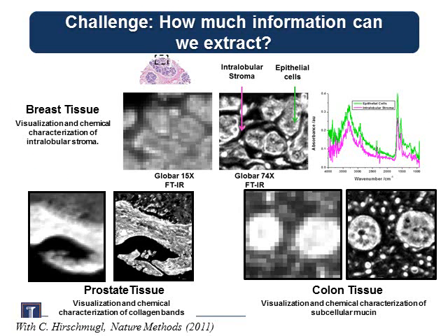So this is, again, slightly older data, and this is an old story now. On the left-hand side in all of these images, you'll see state-of-the-art commercial instrumentation, which gives you this sort of imaging quality. This is using a Spotlight spectrometer. This is using a Varian spectrometer. And this, I believe, is using a Bruker spectrometer. So just to let you know, we're not biased. And this is exactly what you get with every single piece of instrumentation that's out there.